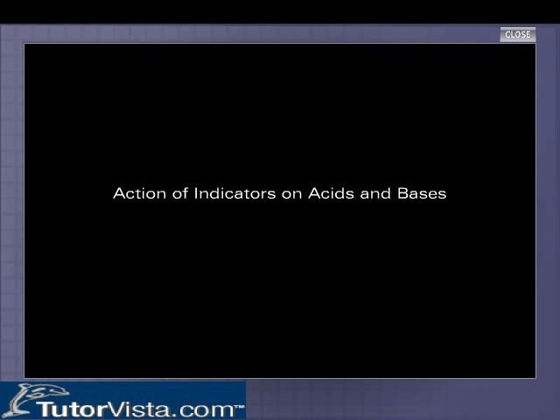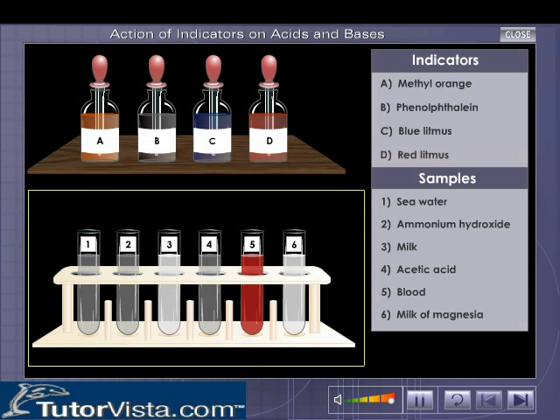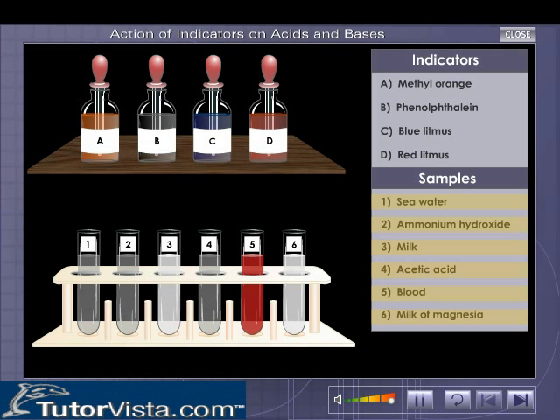Action of Indicators on Acids and Bases. Here are four bottles labelled A, B, C and D, each containing the indicators methyl orange, phenolphthalein, blue litmus and red litmus. Here are six test tubes containing different samples. The samples are listed on the right-hand side.